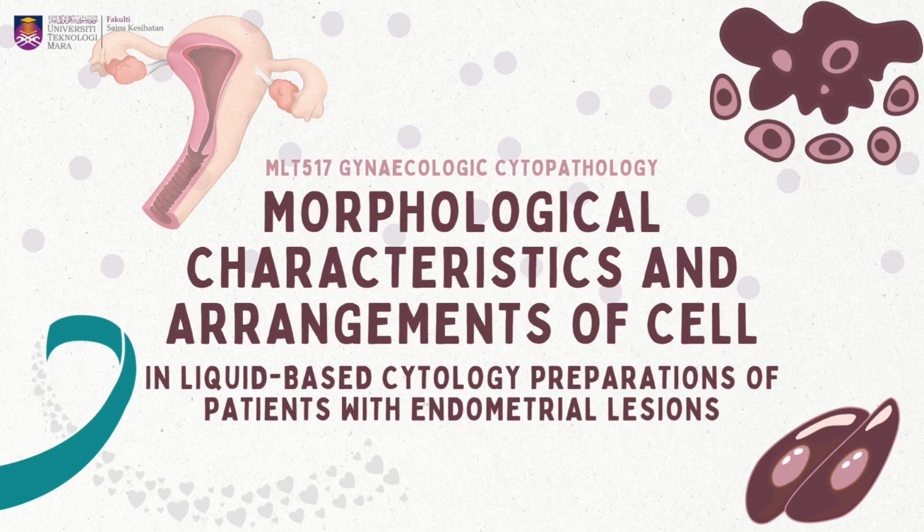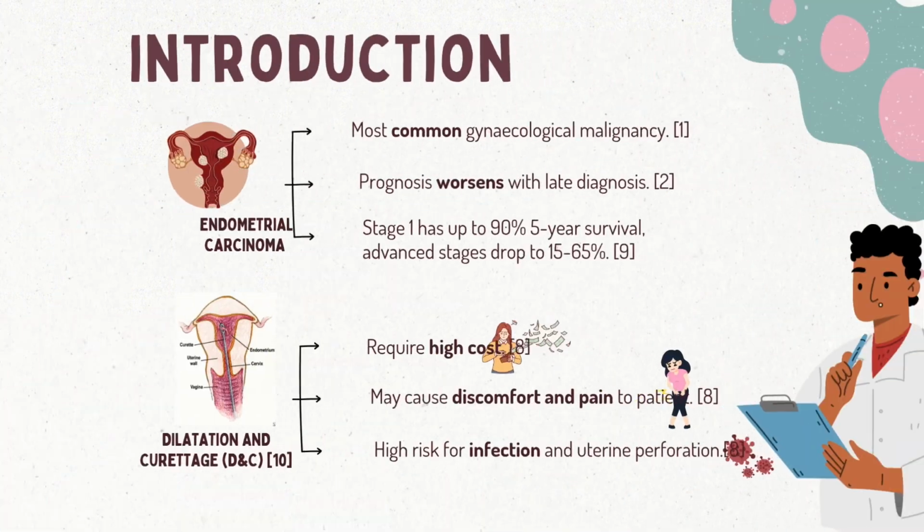Hello everyone. Today, our group will be explaining the morphological characteristics and arrangement of cells in liquid-based cytology preparation of patients with endometrial lesions. I will start with the introduction part.